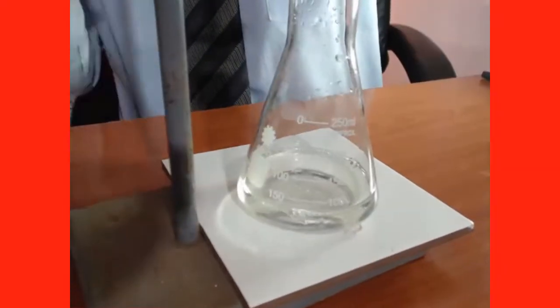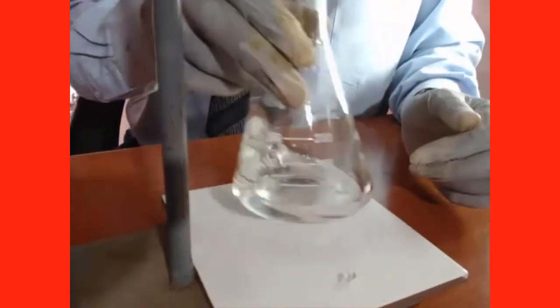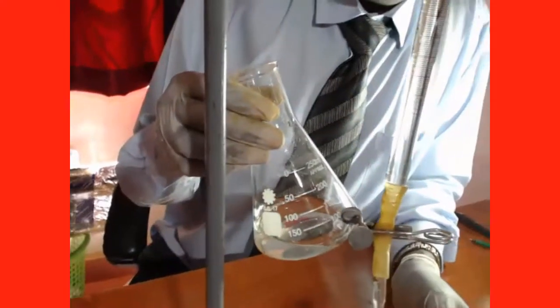The value we have obtained from our burette can now enable us to do calculations to determine the concentration of this sodium hydroxide solution, and that will be our next step.